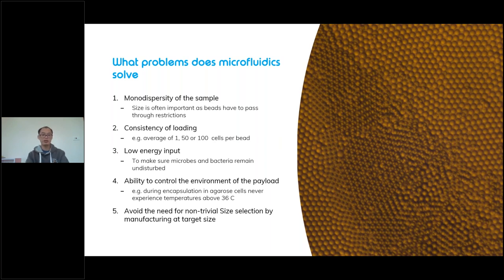The second is the consistency of loading. With microfluidic methods, we can get highly consistent loading, for example an average of 50 or 100 cells per bead. It can be easily obtained by the microfluidic method.